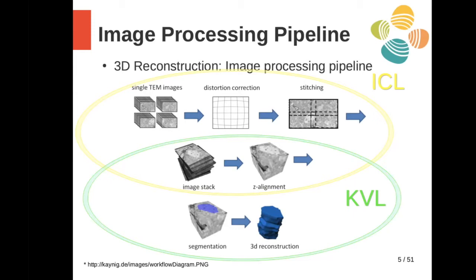And that's basically where we come in. The tool that we will be showing you today, Avizo, does have the capability of doing image stack alignment and normalization. So even if your image stack is in the early stages and hasn't been fully processed yet, we can still help you with that. But having a completely ready, aligned, normalized image stack is typically the nice starting place for the rest of the process. That's where we come in with the segmentation part to help separate the image out into objects, and then the 3D reconstruction, which turns it into viewable objects, meshes and things that you can see in 3D.